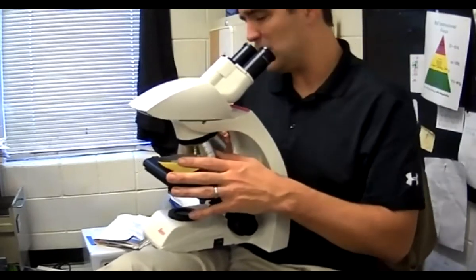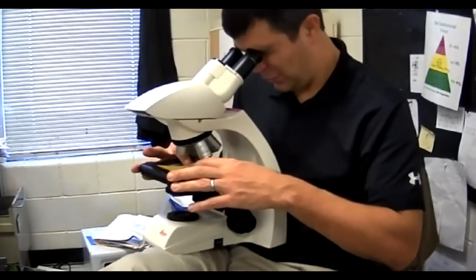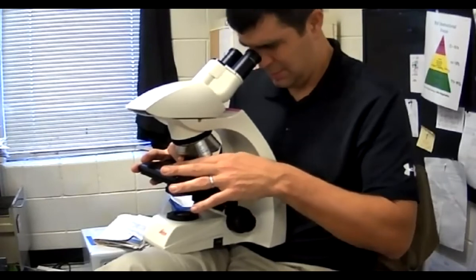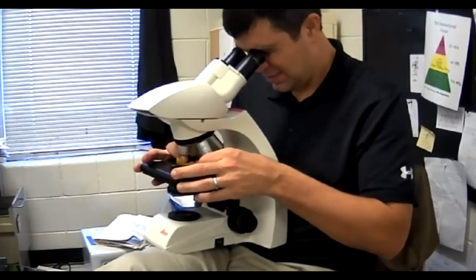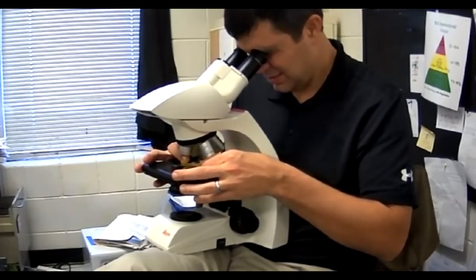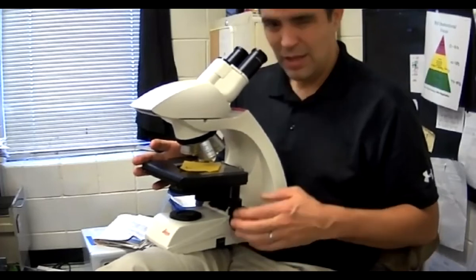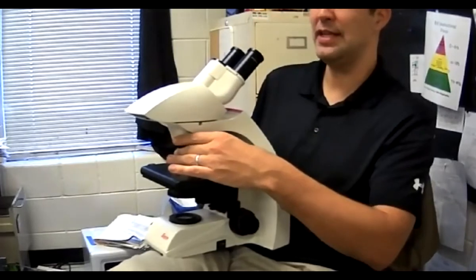If I want to go up to my next power, I'm going to move it to the part I want to see and put that in the center. I want the KJ in the center. Once I have it clear and centered, then I move up to the next power.